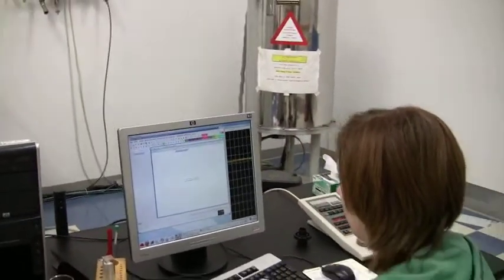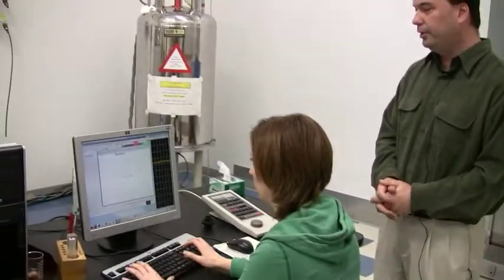This process is done automatically by the computer, and so the student just sets the parameters up correctly, and the spectrometer by itself automatically optimizes the homogeneity of the NMR field.